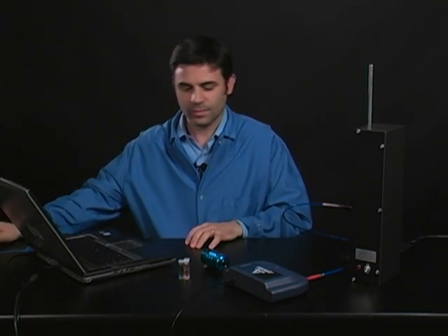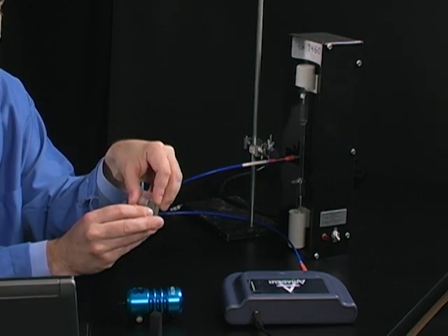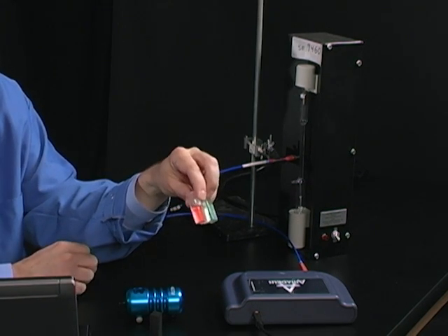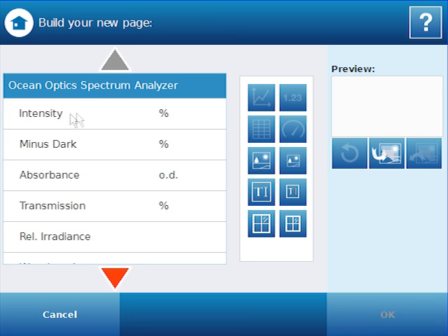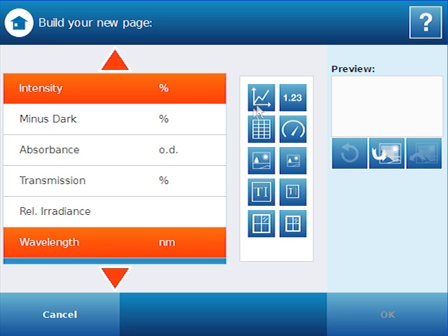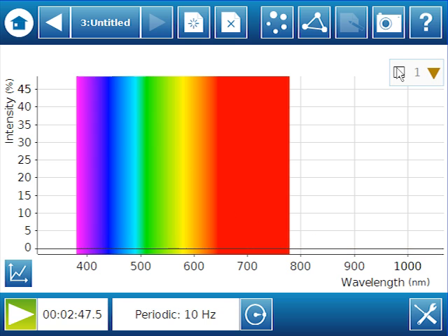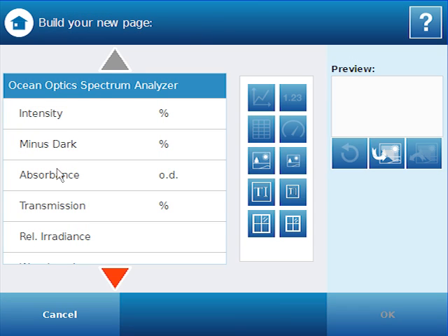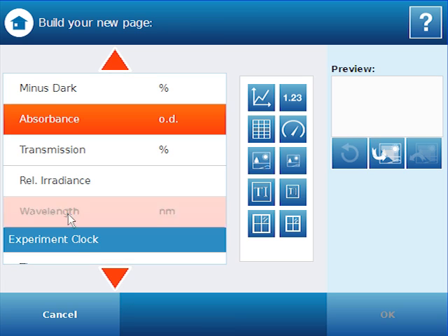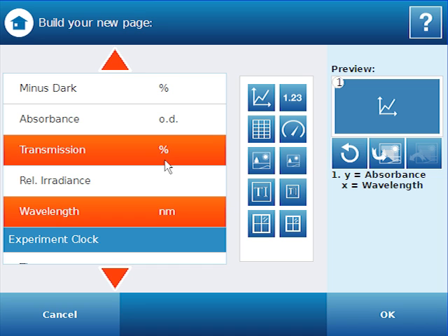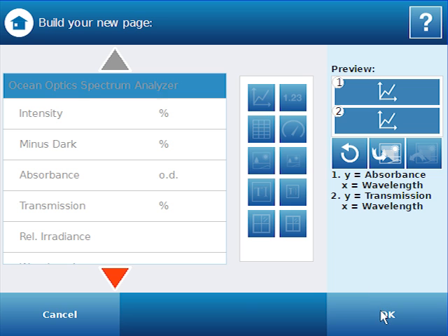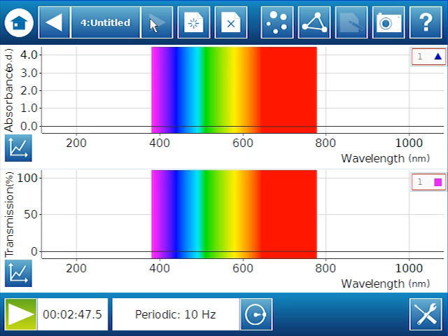So we can look at an emission spectrum fairly easily, and we can do some analysis of those wavelengths. For chemistry, we also want to look at solutions. And so we have a couple of colored solutions. And we're going to look at why these are colored and what they're doing in terms of their wavelengths and the intensity. And then we'll also get into absorbance and transmittance. So I'm going to build a new page. And we'll go intensity versus wavelength just to give us a nice clean graph. And I'm also going to build a page of absorbance versus wavelength in a graph. And finally, transmission versus wavelength. So I have my intensity and I have my absorbance and transmission.